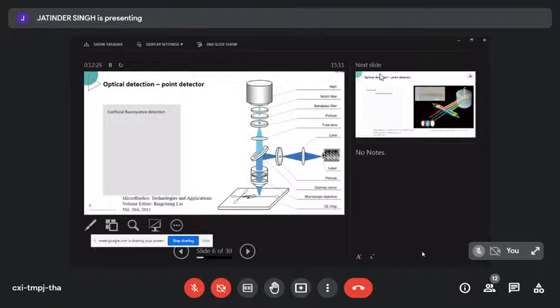Anyone loves optics here? Of course. Because fluorescence detection, one of the good things about being in microfluidics is that you get to build your own detectors. You don't know anything about optics. You have to put that together. You're like, yeah, cool. Where to start? Start with a lot of money.